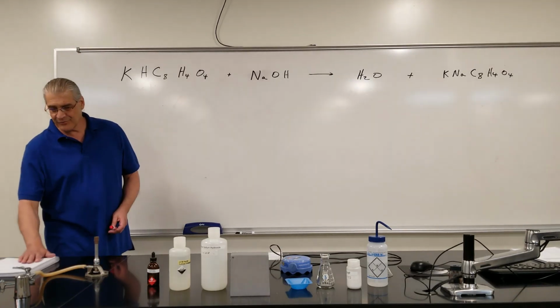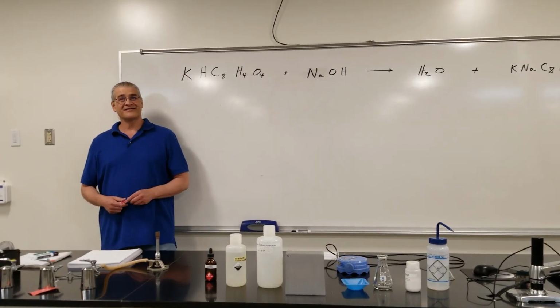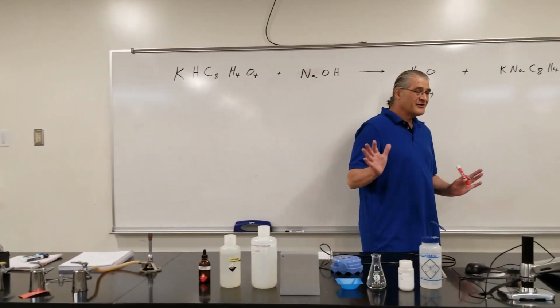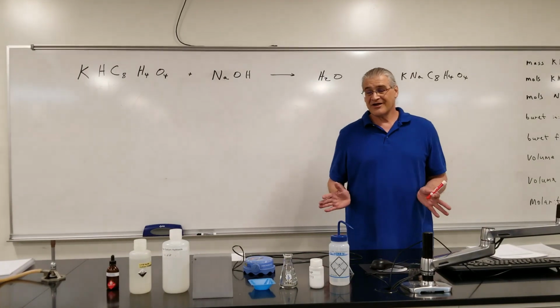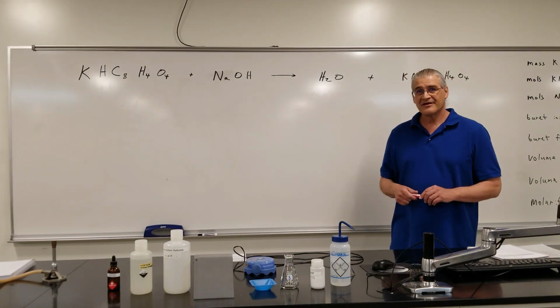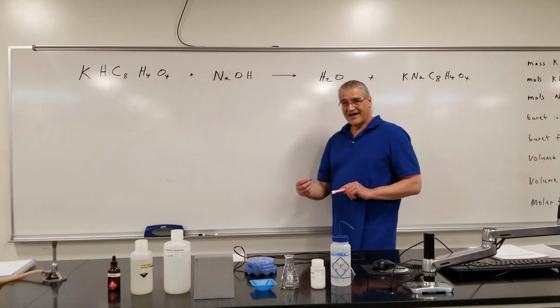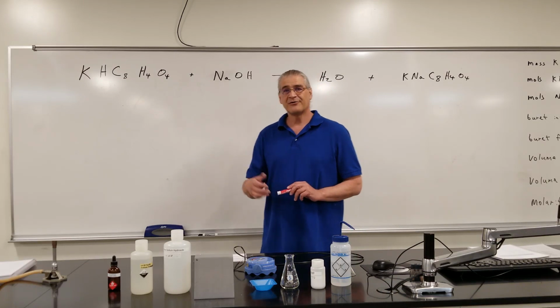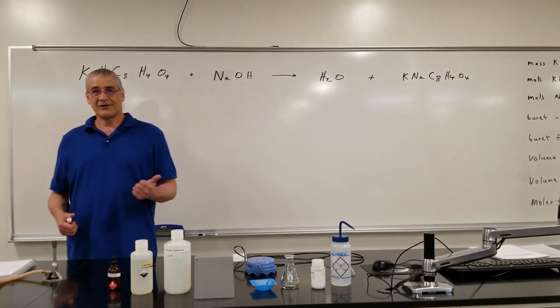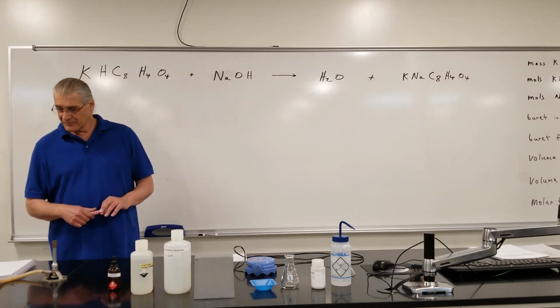Hello and welcome to our video demonstration of quantitative analysis of vinegar via titration. What you're doing today is carrying out a procedure known as a titration, so that you can determine the molarity of acetic acid in a solution of household vinegar. If you didn't know, vinegar is just a solution of water and a chemical known as acetic acid.